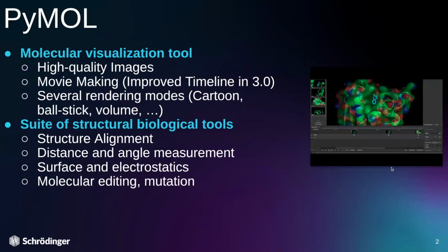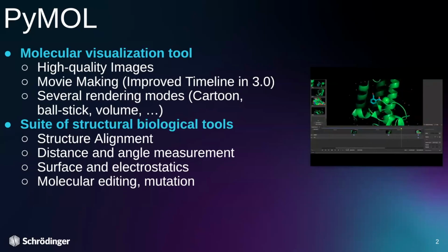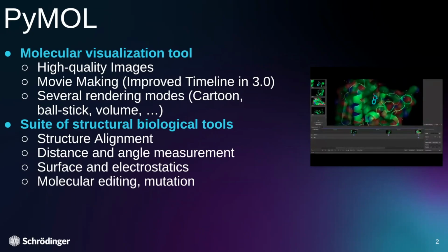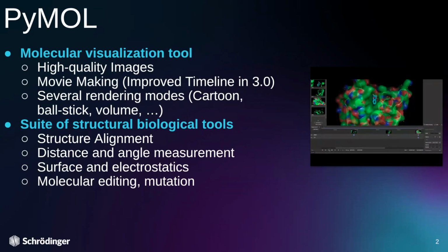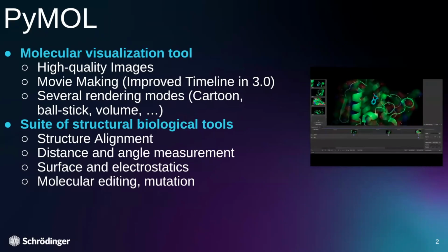If you've ever used a tool like After Effects or Premiere Pro, you have the ability to visualize different tracks in a given movie. What this allows you to do is individually control different objects, camera, and different settings, which wasn't really easily doable in the old movie maker, so you're able to make a lot more compelling movies. It's just a better way to visualize the organization of your movie.